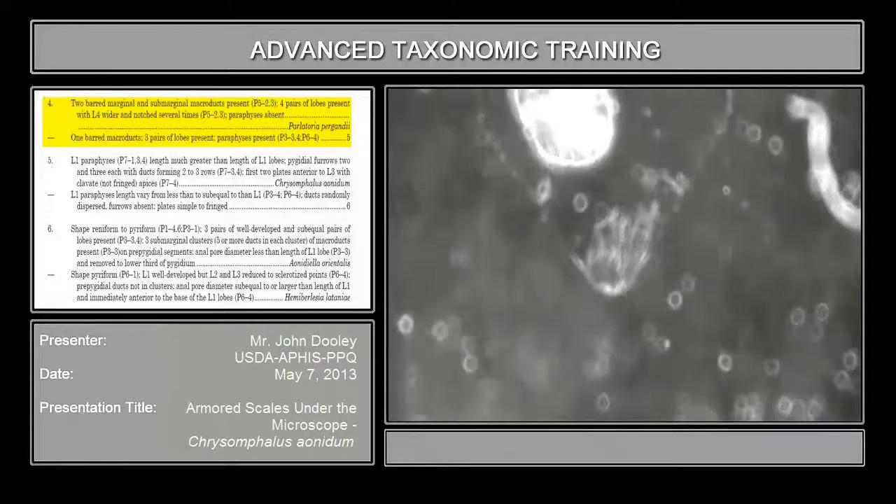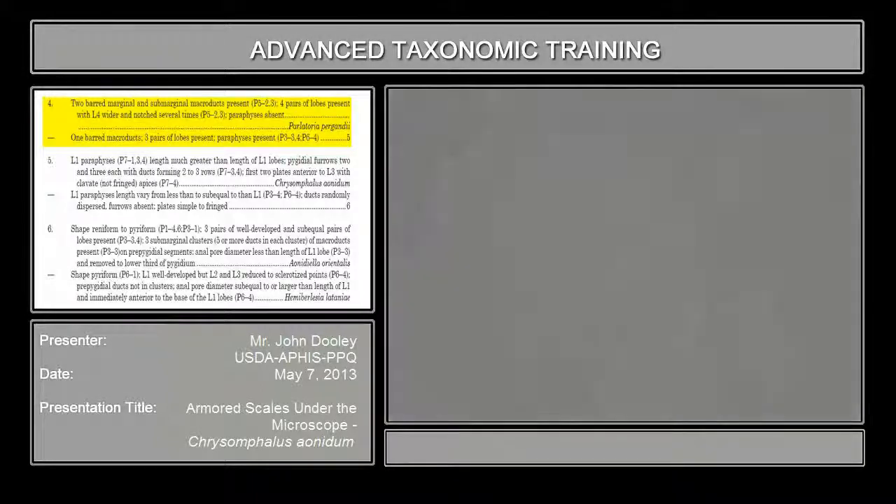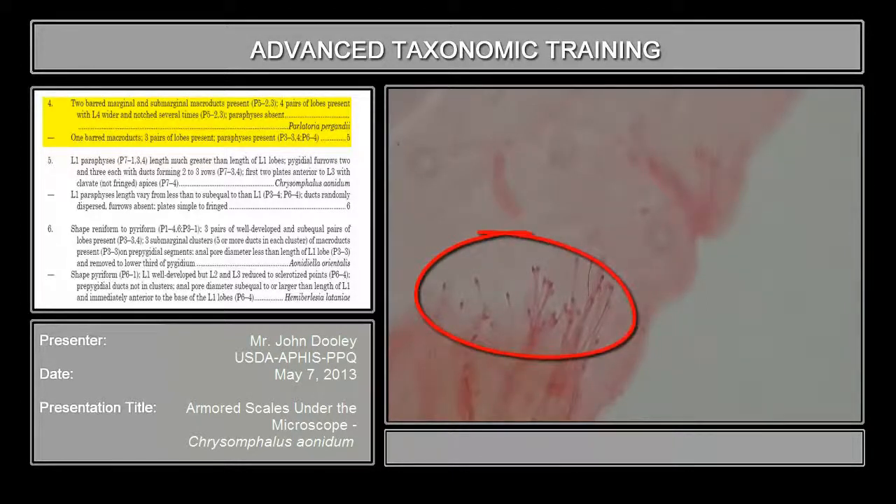Let's see if I can find it here. Let's go above the pygidium, and you'll see a cluster of macroducts. You see the macroducts at the lower field of vision right here? You can see them. Those are pretty nice, and then you have another set right over here.